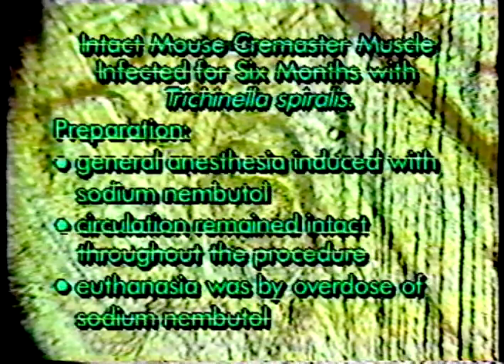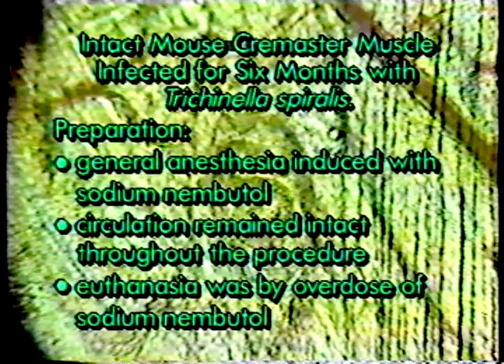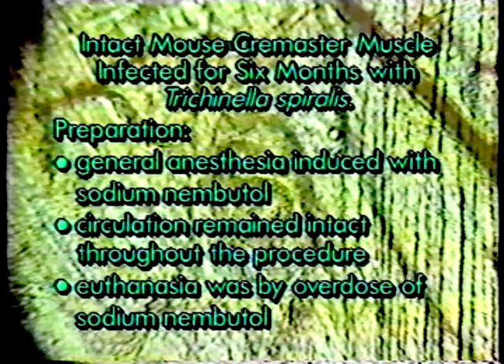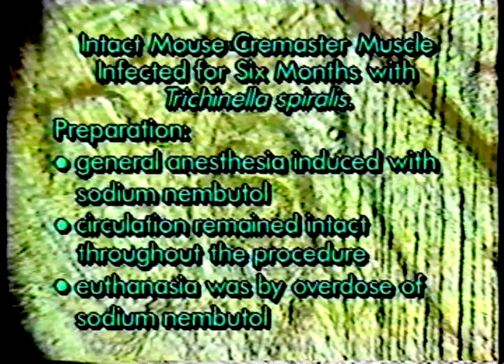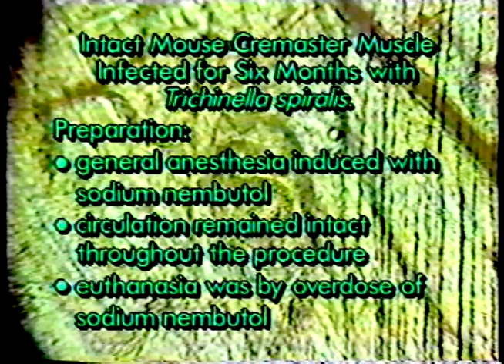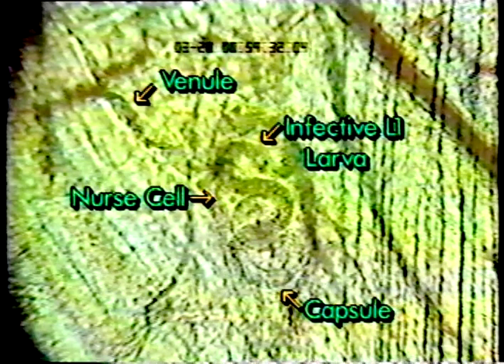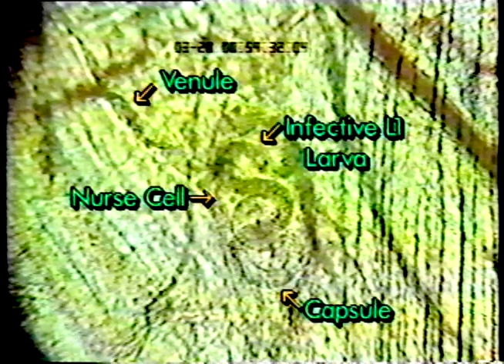The living intact nurse cell parasite complex can be conveniently viewed in the cremaster muscle of an infected mouse at several magnifications by preparing the entire infected animal for intravital microscopy. Nemutol was used as the anesthetic, and the mouse was killed at the end of the experiment by an overdose of the same drug. The diagram shows the relationship of the nurse cell parasite complex to the rest of the muscle tissue. This freeze frame shows an intact nurse cell parasite complex in the cremaster muscle of an infected mouse.